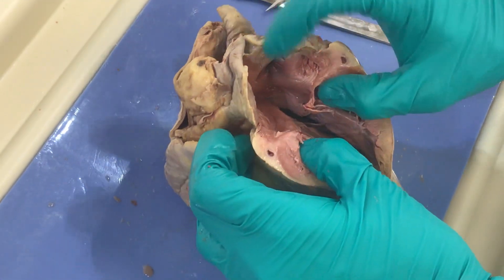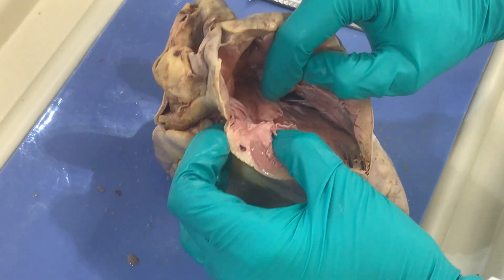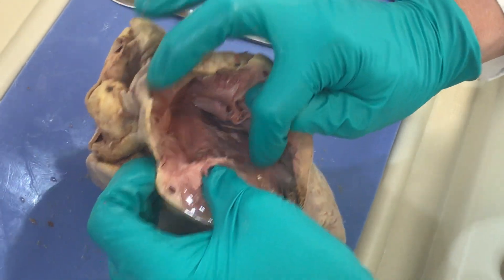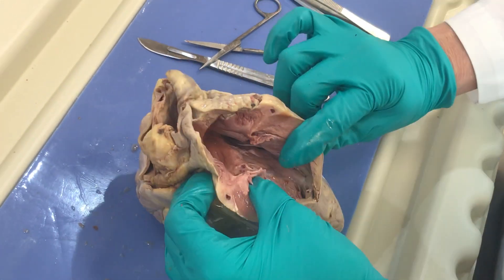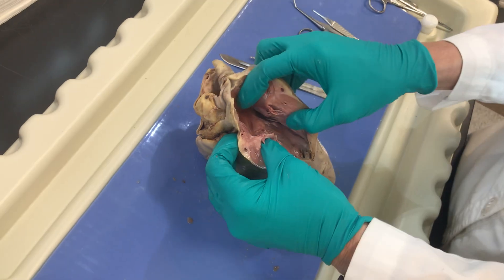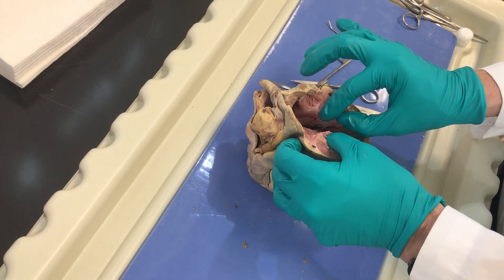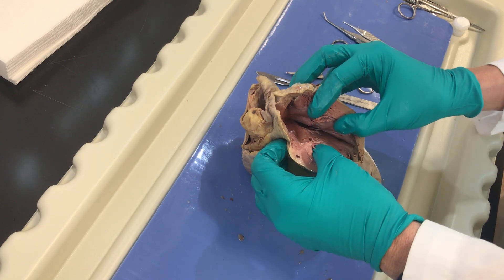So again, you need to know these structures: right atrium, right auricle, the cusps of our right AV valve. Remember, AV valves are the ones that have the chordae tendineae and are anchored to the papillary muscles. This is my right ventricle. Another name for this valve is right AV valve or tricuspid valve. It's called the tricuspid because it actually has three flaps — that's why it's named the tricuspid.